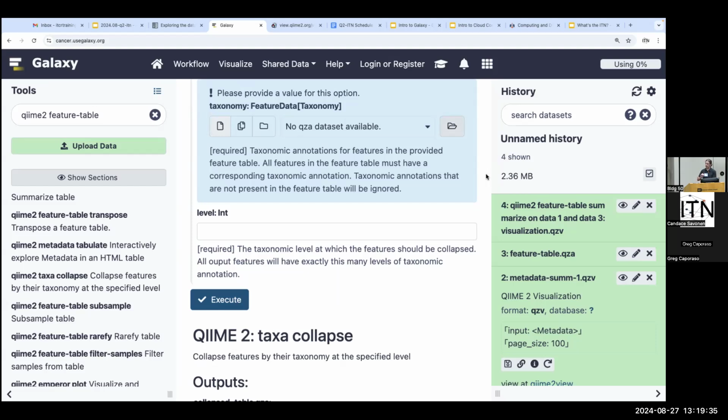We made a specific choice on how to represent this data because we wanted to be able to put other metadata in there. We wanted to be able to change the underlying formats without the user having to be aware. For example, if we were to come up with a new file format that was able to compress FASTQ files to much smaller sizes, we could swap that out under the hood and you as the user wouldn't have to know about that. You could still convert between different formats and export things in whatever format you want, but under the hood, we could make some changes that make the system work more efficiently.